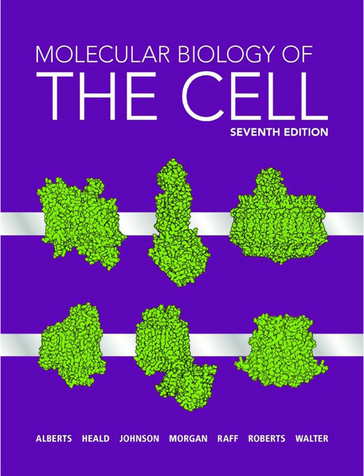So lots of 2D views from different angles. Exactly. Then computational algorithms, similar to CT reconstruction, combine all those tilted views to calculate a 3D reconstruction, a tomogram, of that volume of the cell. Giving you the 3D architecture. Yes. And you can computationally slice through that tomogram in any direction.